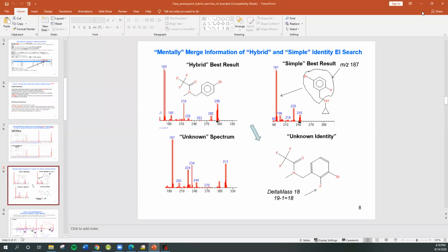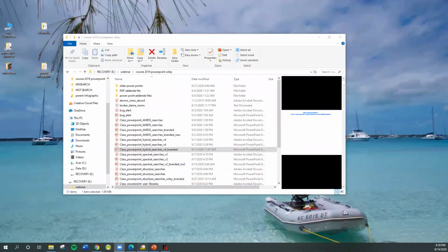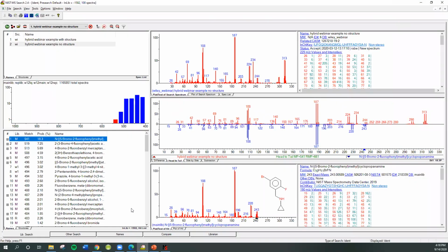So we pretty much have gone through the introduction now. I want to go to the actual demo now. So we need to switch screens here, see if I can do this pretty smoothly. I'll leave that right there. Go open the NIST library. Okay, so I hope you're seeing the NIST library now. I'm sure Ryan will let me know if there's a problem, but we should have it come into focus.